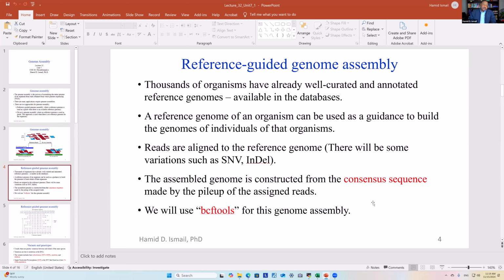So whenever you come to do any kind of genome assembly, just go there and look in the database for that reference genome, and you know how to search for a reference genome. And don't forget, you can always go to the NCBI nucleotide database and use that search query. If you use RefSeq, then you can get that reference sequence, and you can type something like whole genome or complete genome or something like that.